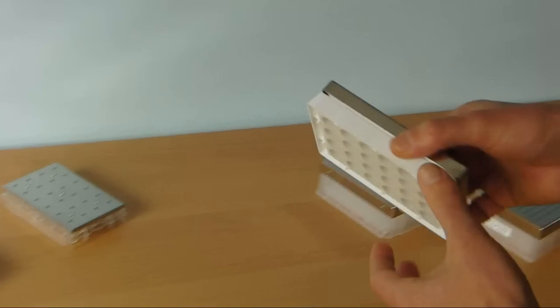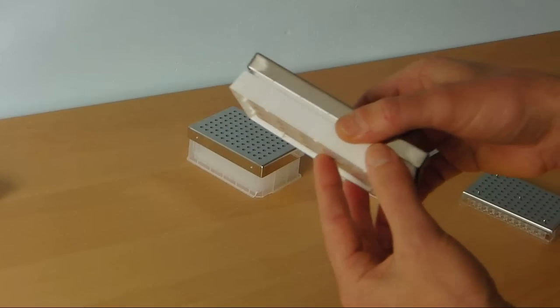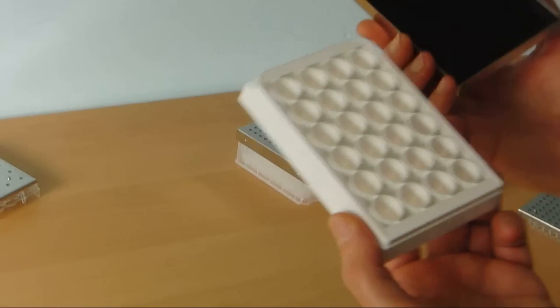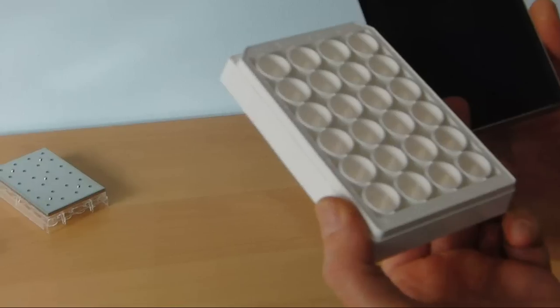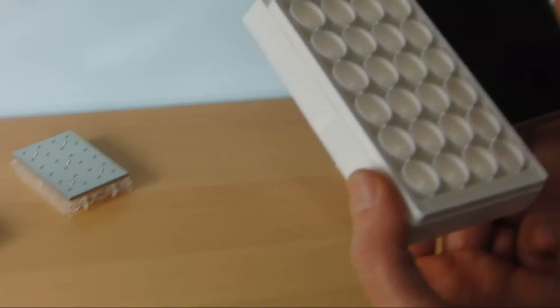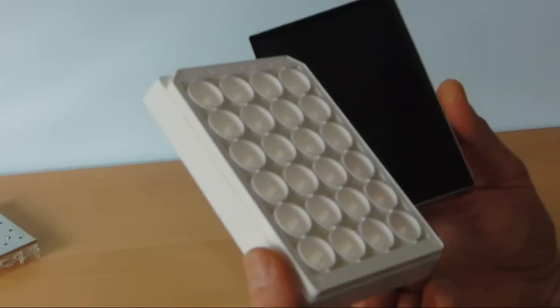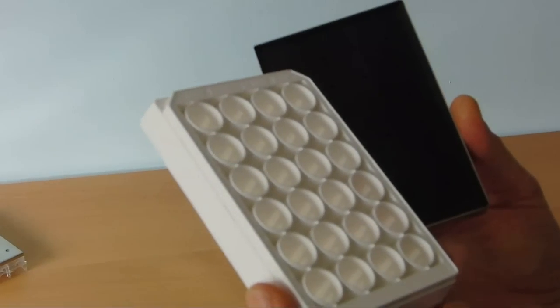For other types of low well microtiter plates with 24 wells, we have so-called universal covers. These are also available in a normal and a low evaporation version, both with spongy silicone inlays and, as in this cover, with a solid black silicone layer.